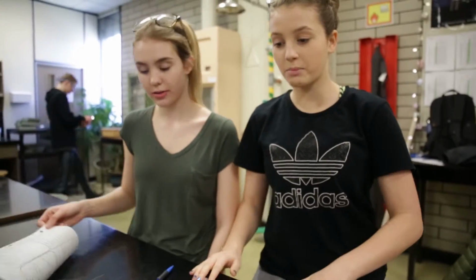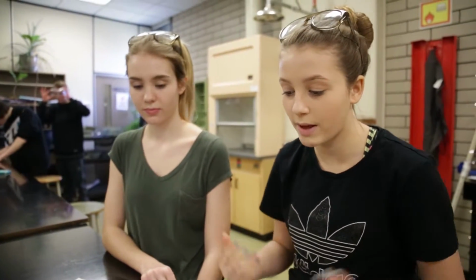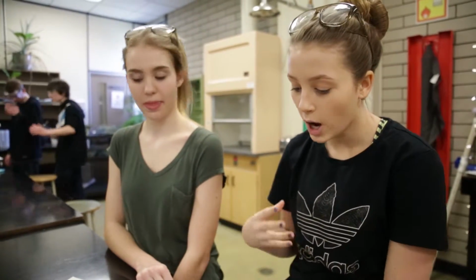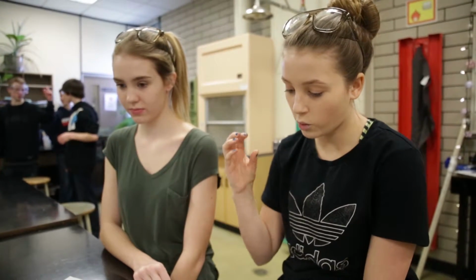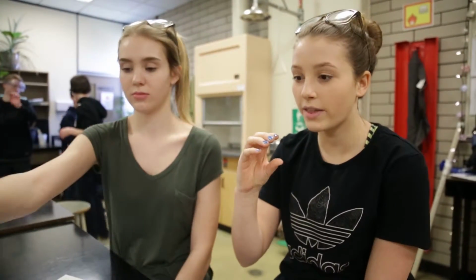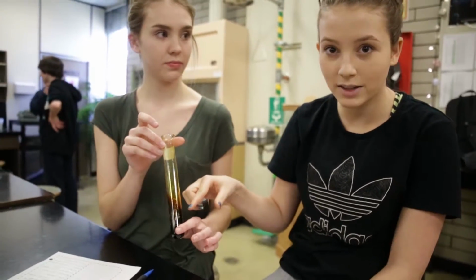And then for solution B, we predicted that it was also going to burn like water because it looked like water and we couldn't smell any harsh chemicals. And then when we started to burn it, it started out like water, but once you burned it for a long time, it went yellow, and it kept getting darker and darker until it had become a black substance.